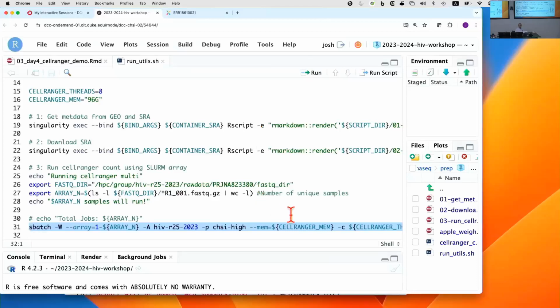And I will say that getting this to work right can be a little bit of a pain in the butt, which is part of the reason why, if we ran this data set directly, one sample, then the next sample, then the next, maybe it would have taken a week, or half a week. And as far as I'm concerned, I'd rather let it run for a week and come back than spend a couple of hours of my time getting it to run in a day instead of a week.